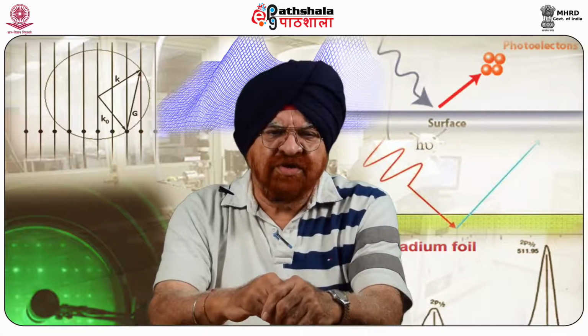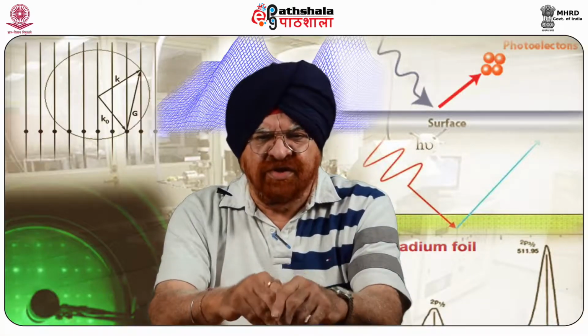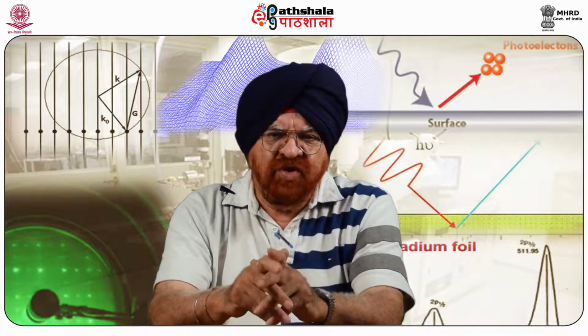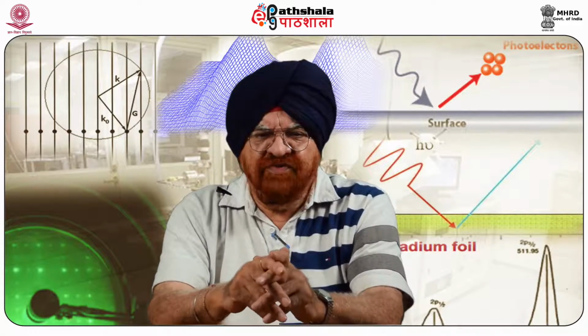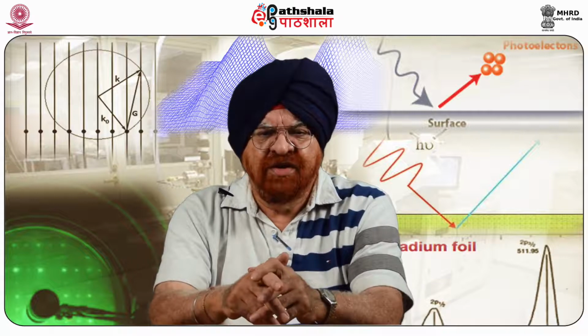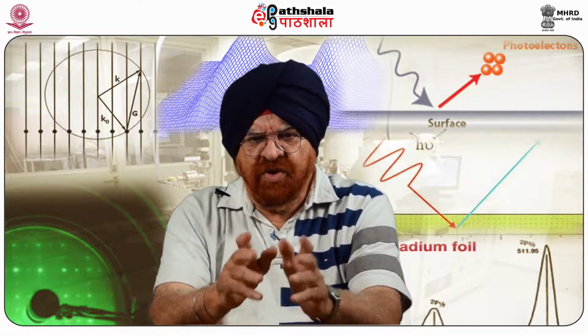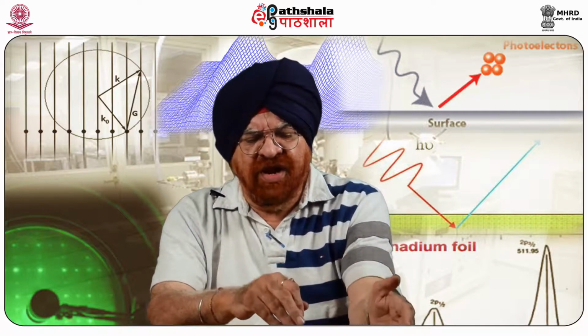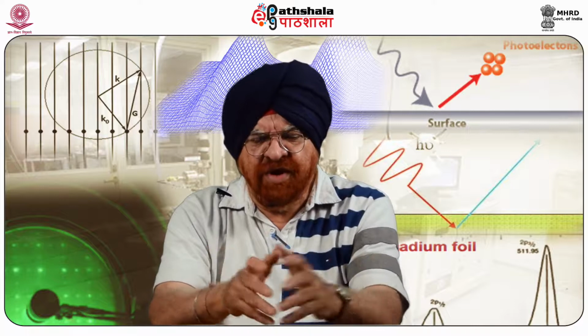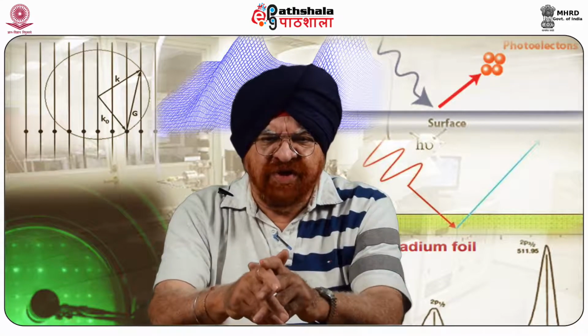Now the next question that comes to one's mind is, why ESCA? Why should we study this? What is the importance of this? When we do this study, we can have elemental identification and quantification of any element from lithium to uranium. That means from a very light element like lithium with a very low atomic number of 3 to uranium, which is 92, a very heavy element, we can utilize this very effectively.